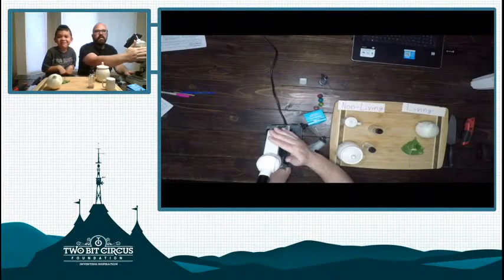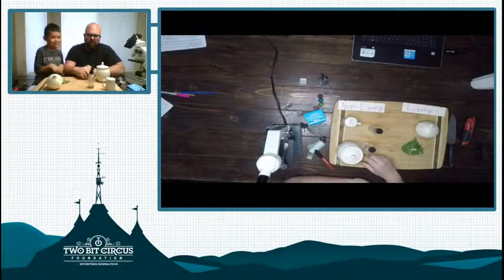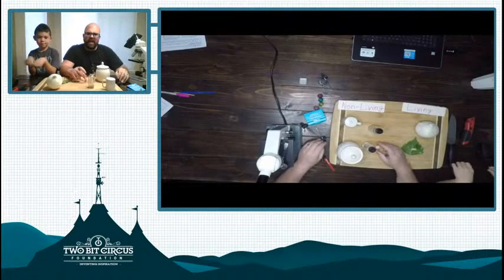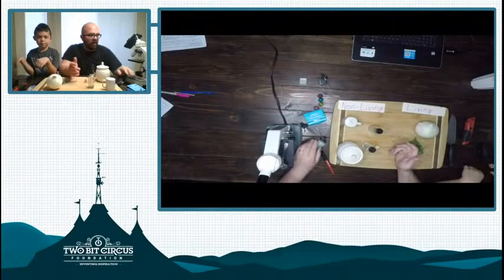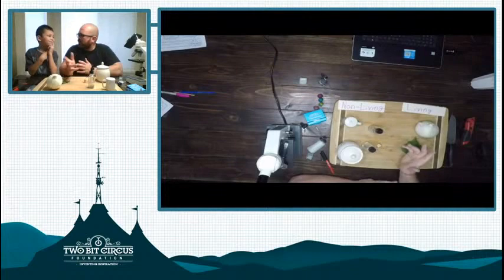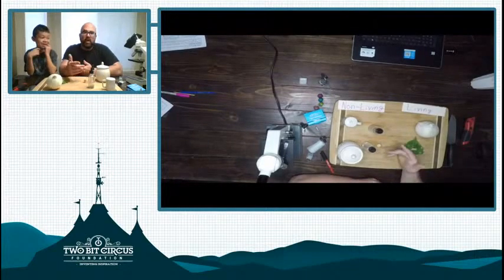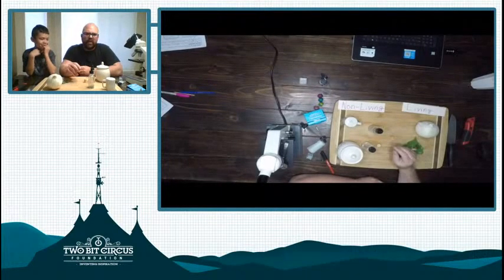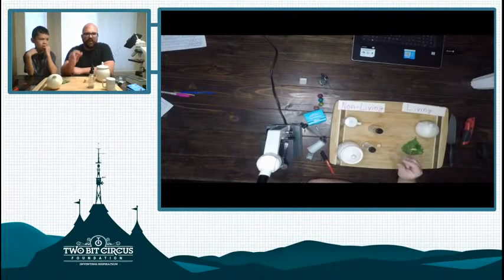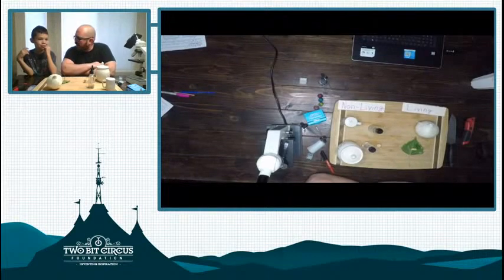And so you can see here that we have a fancy microscope. But if you don't have a fancy microscope like this at home, and you don't really want to spend a lot of money on a fancy microscope, the little kid microscopes that you could get for around $20 or so will allow you to do this lab as well. You don't need something fancy with electricity and light. One of the basic ones with just a little mirror will work under there.